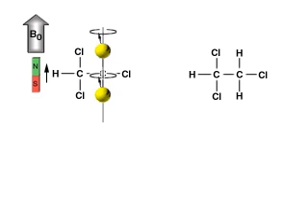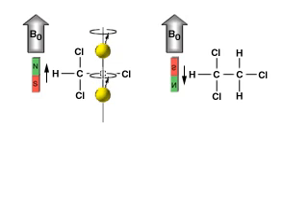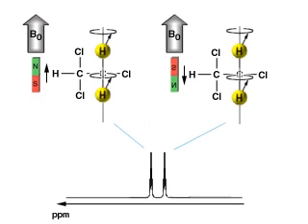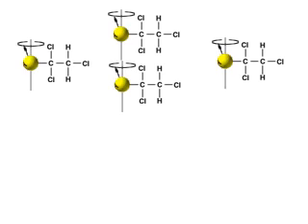If the spin of the methine proton is opposed to B0, then its magnetic moment subtracts from the magnetic field experienced by the methylene protons, which slightly decreases their resonance frequency. The methine spin can align either way, and two peaks are observed for the methylene protons. The methine proton also senses the spin orientation of the methylene protons.